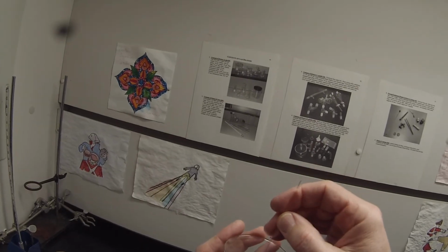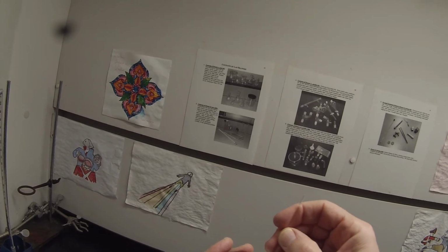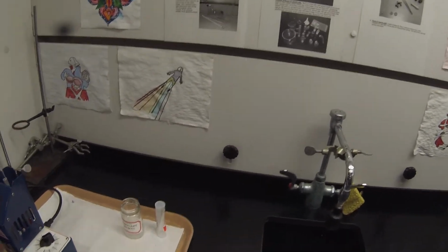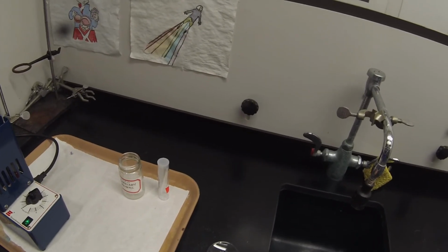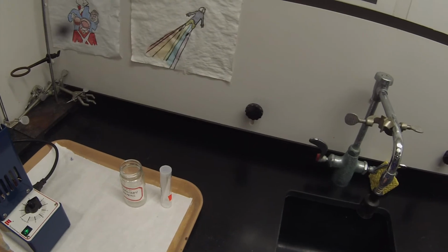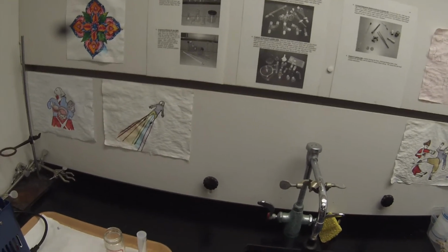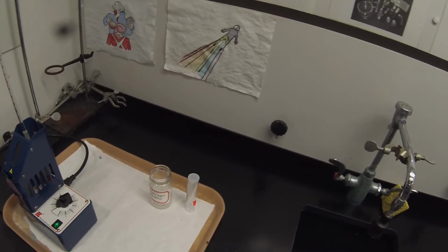So I'm just doing the same thing I did before. Trying to get 4 or 5 millimeters worth of material in there. Putting in a little bit more than I did last time. Last time, by the time I tapped it down, it was a little sparse.